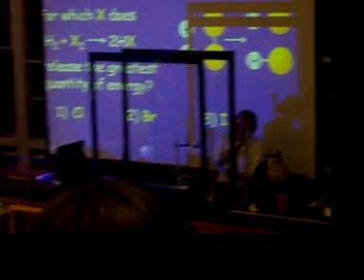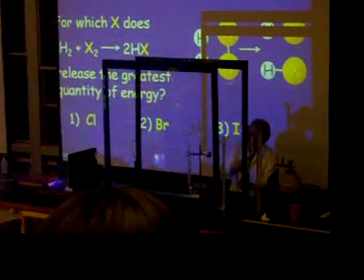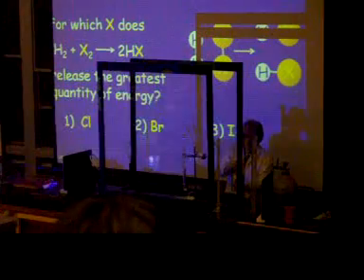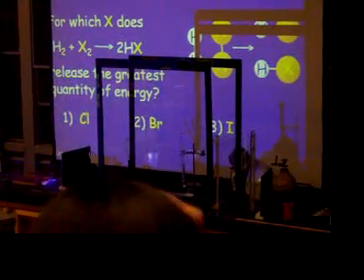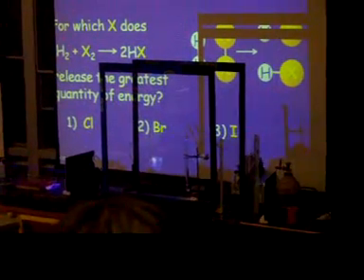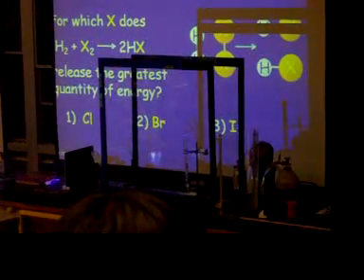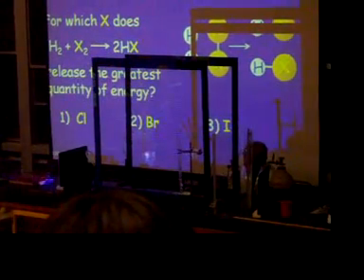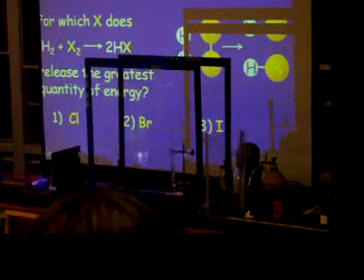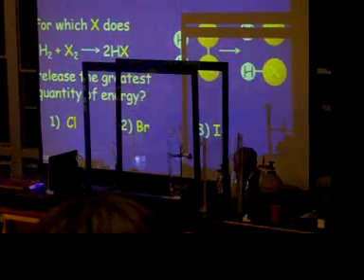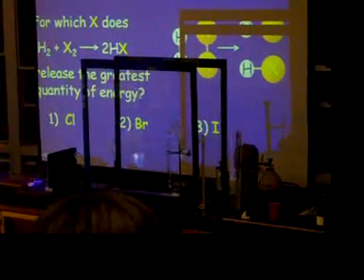And then we'll see whether, I'll tell you what halogen you put in there, relative to the answer to your clicker quiz. Tell me when you're ready, Lottie. He's displacing water by bubbling in molecular hydrogen and a molecular halide.